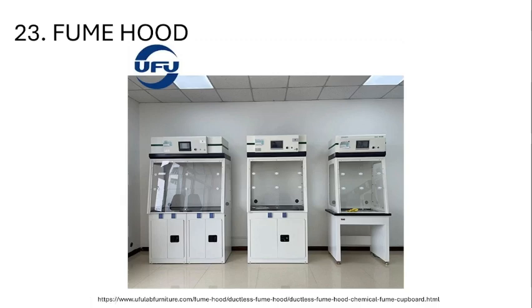In some laboratories, there are some with attached gloves here, so you will simply put your hands inside with less exposure to the chemicals. But in our lab, since it's just a modified version, we'll make the most out of it.